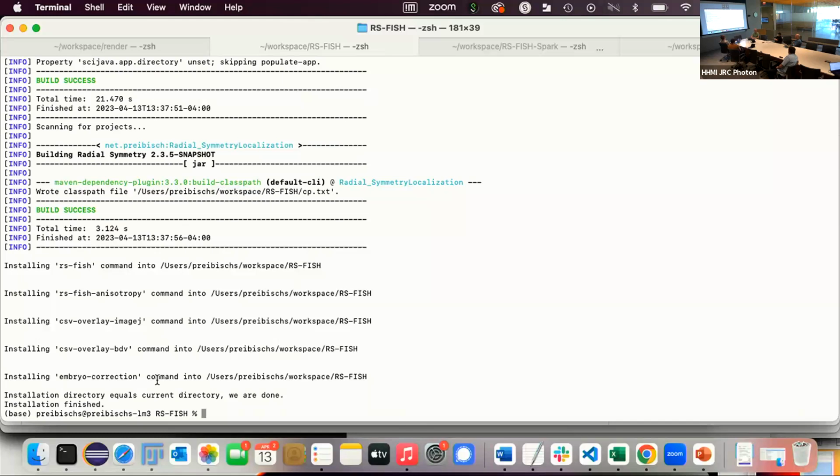So we used it because we actually needed the intensities, because we were extracting transcription sites, and it tells you what a transcription site is. We need to actually amplify the transcription intensity. That's good. But I don't need this here.